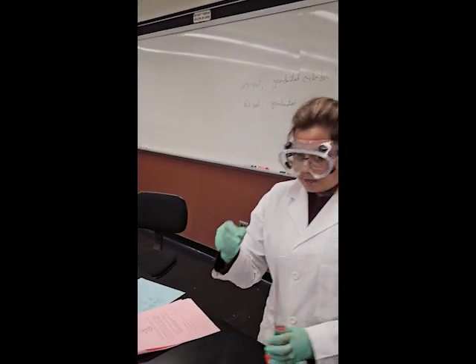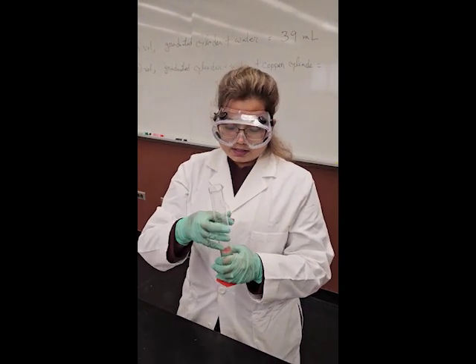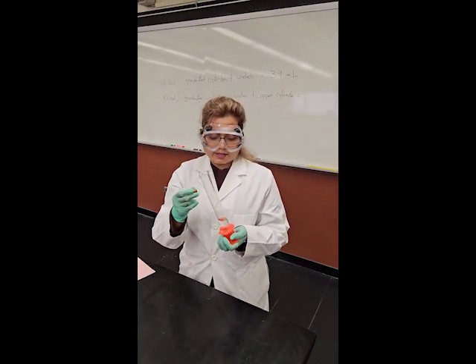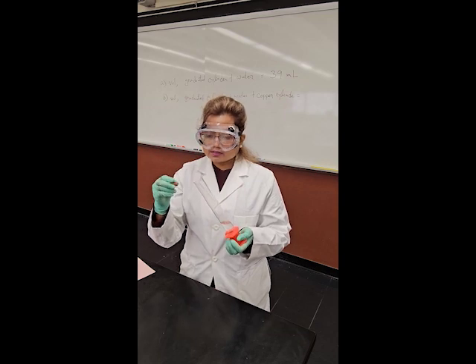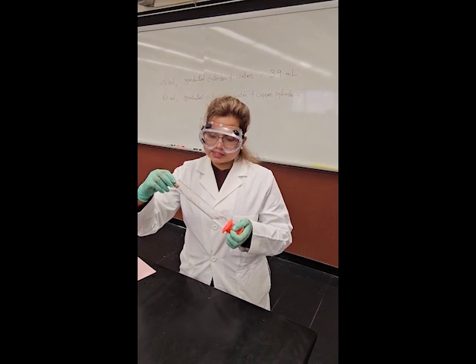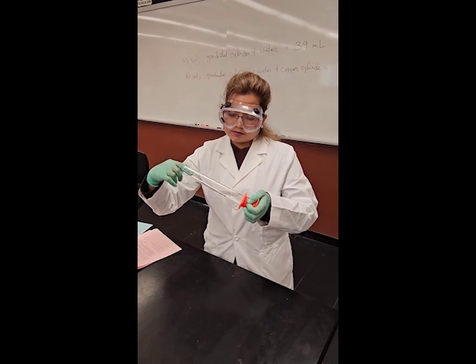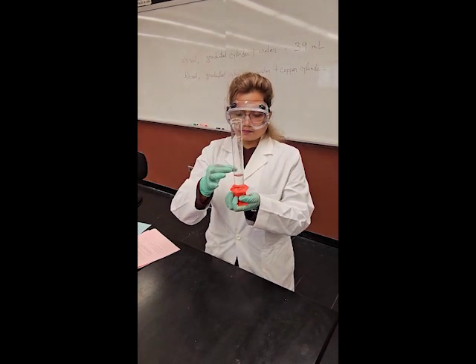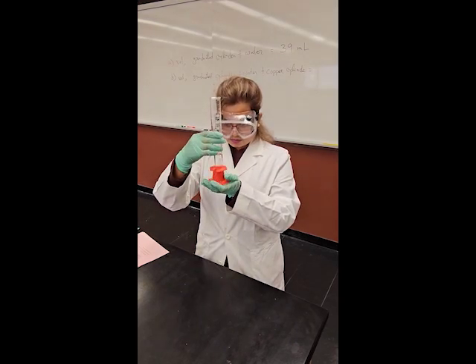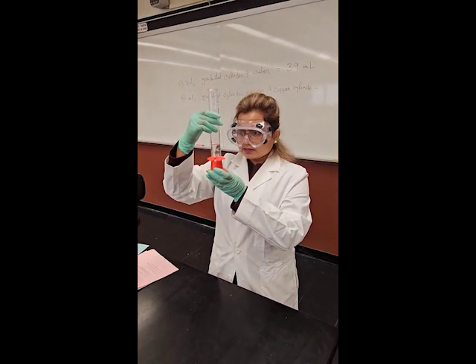When you drop any metal in glassware, make sure you don't drop it suddenly, because glassware can break. It's very thin glass. So when you put any metal inside, you should slide it so that it doesn't break. So, copper. I'm getting some bubbles here, which I don't want. Okay. So now at eye level, I can see.